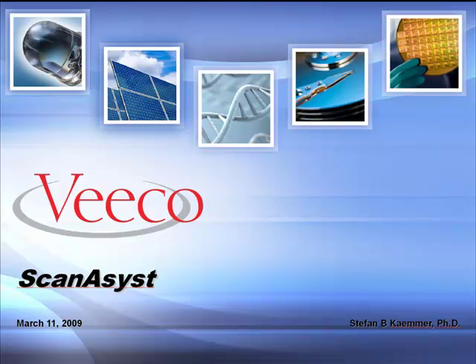This is going to be a short introduction into our new ScanAsyst feature. We'll start with a short PowerPoint, just a couple of slides, and then go into a video showing you the setup and the functionality of ScanAsyst. Let's get started.